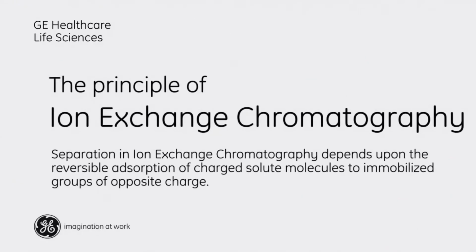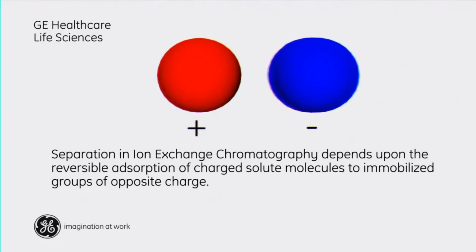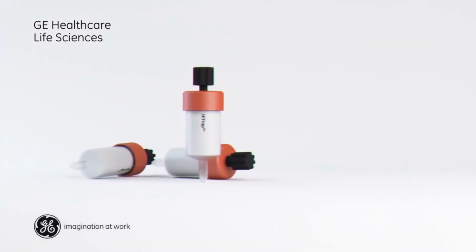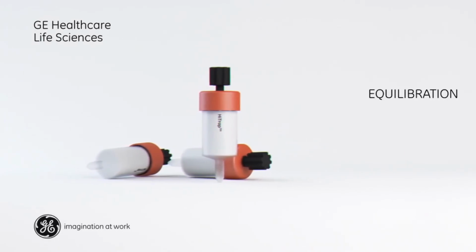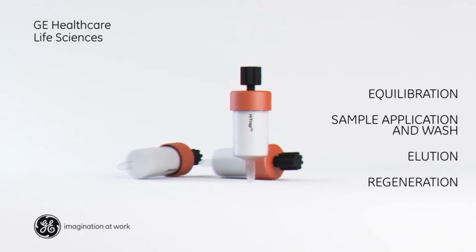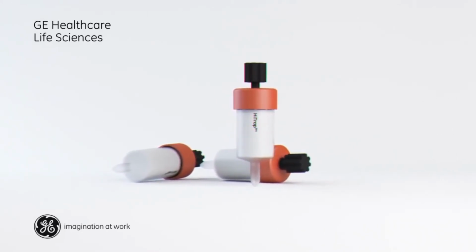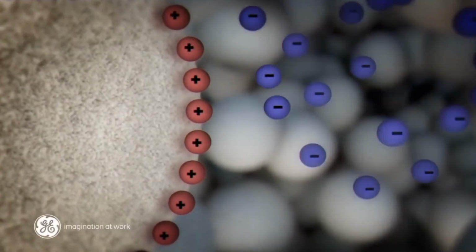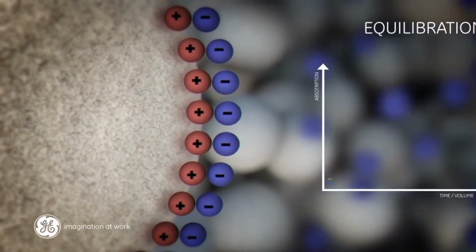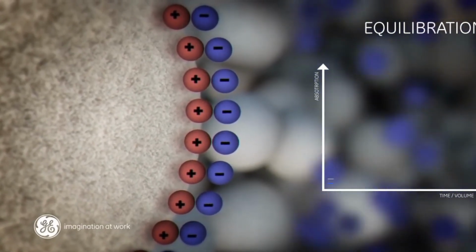Separation in ion exchange chromatography depends upon the reversible adsorption of charged solute molecules to immobilized groups of opposite charge. Most ion exchange experiments are performed in four main stages: equilibration, sample application and wash, elution, and regeneration. The first step is the equilibration of the stationary phase to the desired start conditions. When equilibrium is reached, all stationary phase charged groups are associated with exchangeable counterions, such as chloride or sodium.